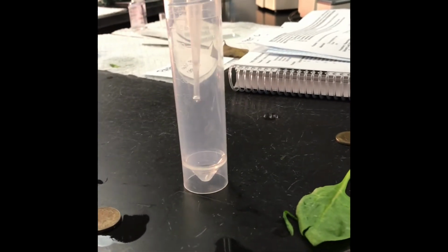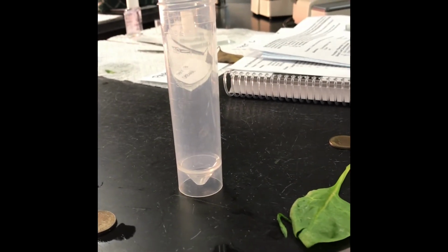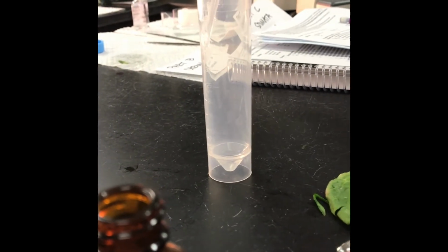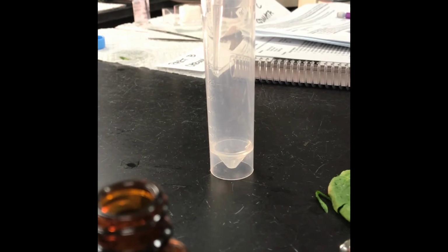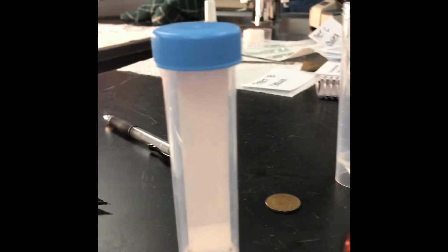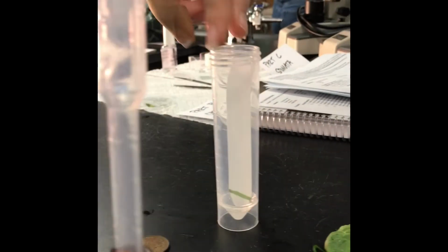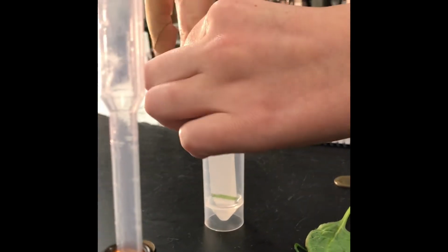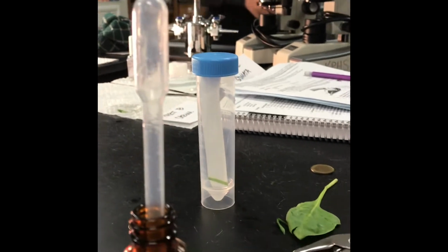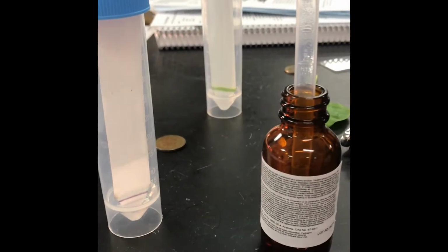We've got the second one filling up now. And then this is where the spinach leaf is gonna go. They have beautiful AP students doing this technique for y'all. I think that's enough. Yep, that's probably perfect. Look at that solvent line, how fast it travels in that one. Okay, so there's a spinach leaf, and they're going to cap them, let these run. Be careful not to tip them over. Already gone up. Okay, see if you can see that solvent line.